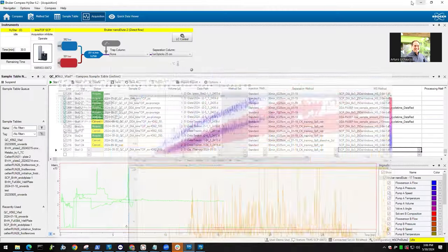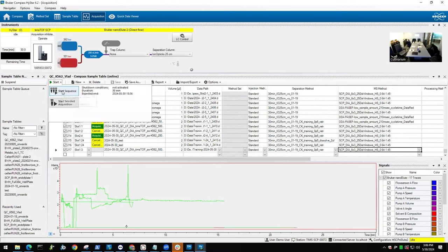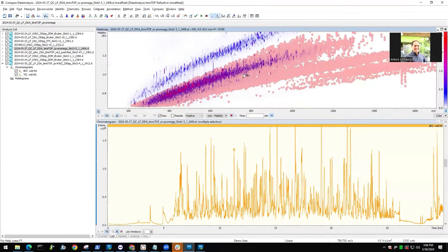All right. So I just save this one and I say start. Yes. And now it prepared the injection. First it starts equilibrating the column, then washing the autosampler needle, and takes the sample. That takes a little while. In the meantime, we can go a little bit through how the data look like and what information you can read out of it. I think I have a few things open here.